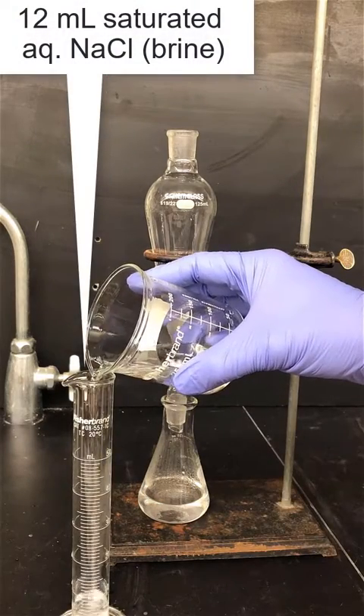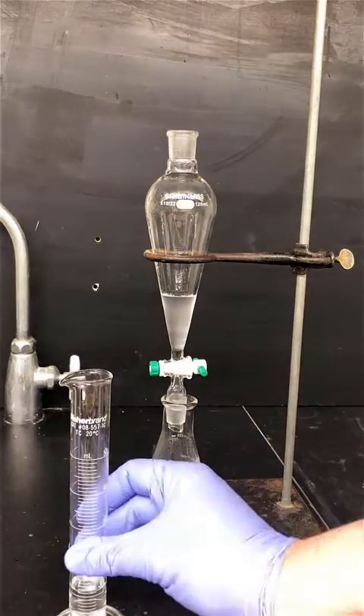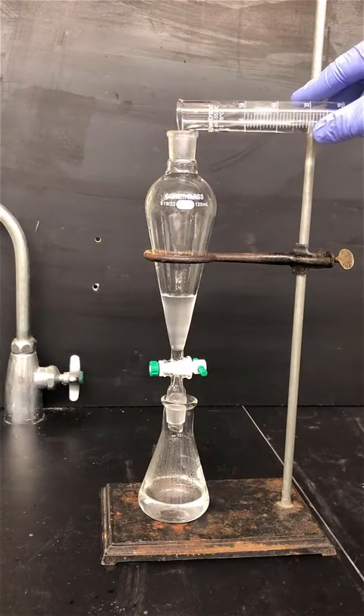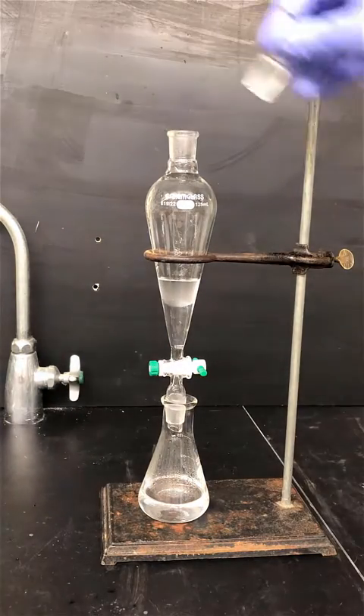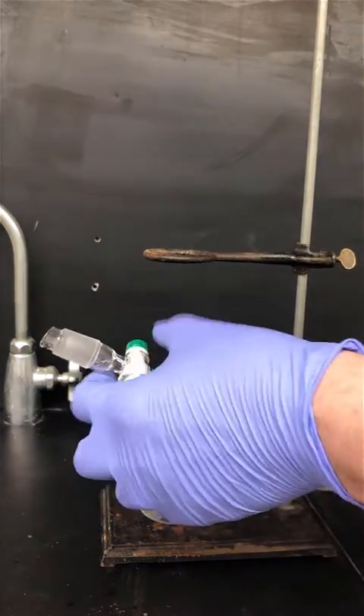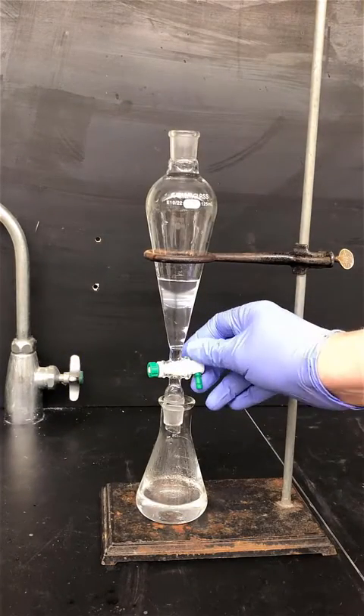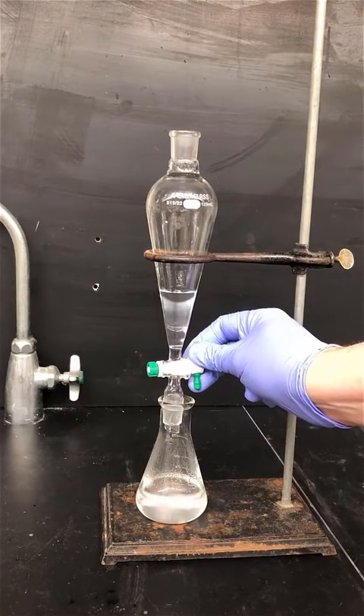Next we'll wash with 12 milliliters of saturated aqueous sodium chloride, or brine. The purpose of this step is to help clarify the organic layer. Again, drain the aqueous layer out of the bottom of the separatory funnel.